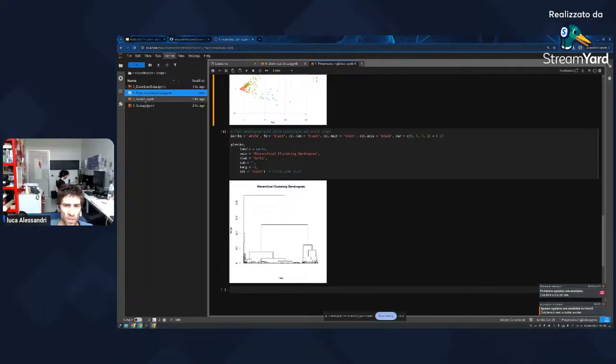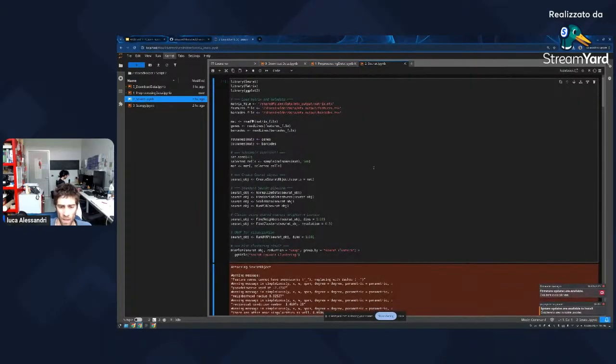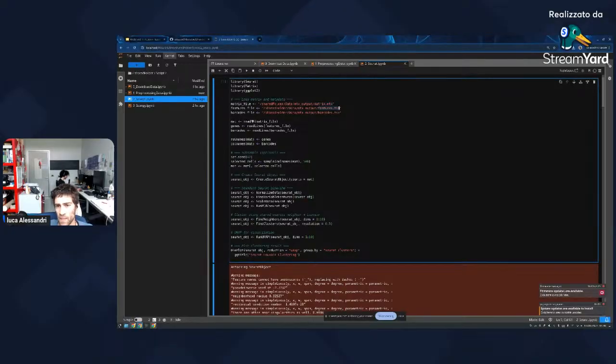So the second one that you will find is Seurat. You will see that most of the time Seurat will use exactly the same command lines that you have seen from my previous colleague, and these command lines are basically creating what is called a Seurat object. Starting from an MTX and TSV file, of course, you could have started already from RDS, because as I said before, RDS is made specifically for Seurat. But since I wanted to generalize everything, I converted everything to these MTX and TSV files.